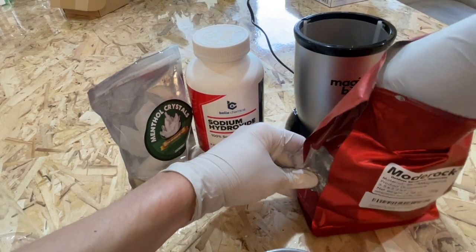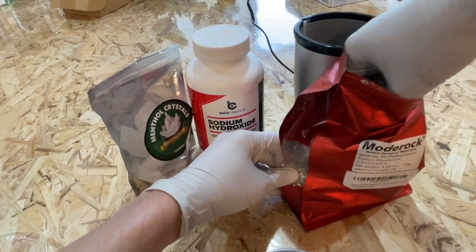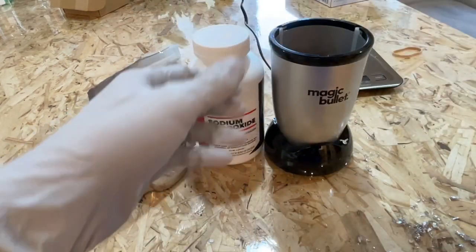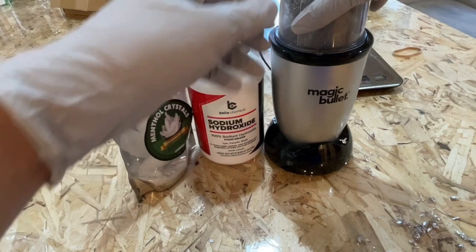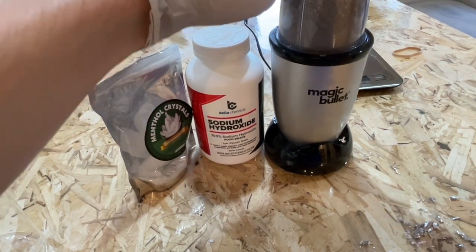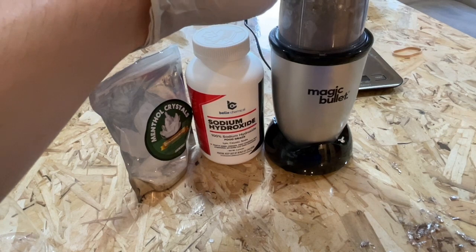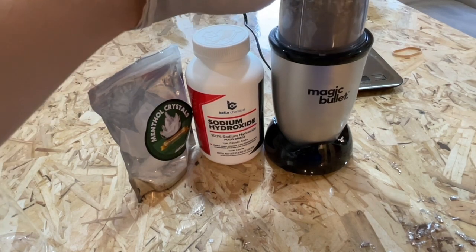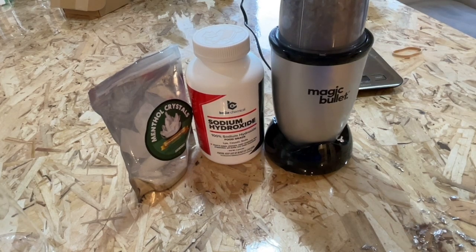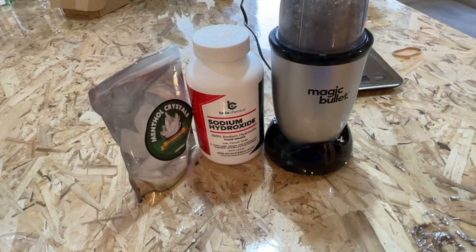Next, I put some magnesium fire starter shavings in a blender and blended until a coarse powder was obtained. Please note that this is a potentially dangerous thing to do — if the magnesium ignites, it could be a bad time. It is a good idea to proceed carefully and cautiously with frequent pausing during blending. Previously, I attempted this experiment using the full magnesium shavings; however, the shavings would get tangled up together and prevent the mixture from being stirred efficiently.